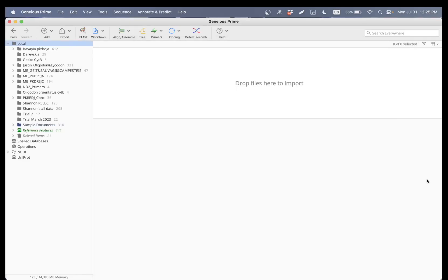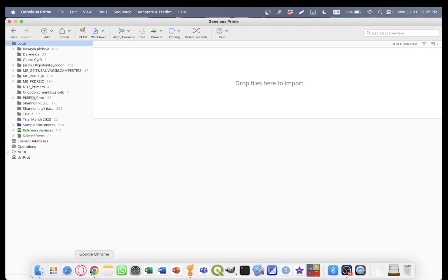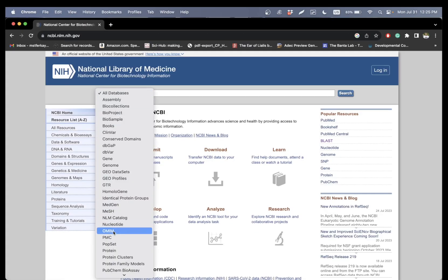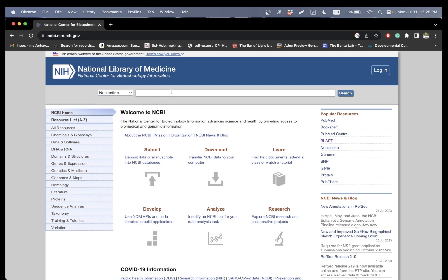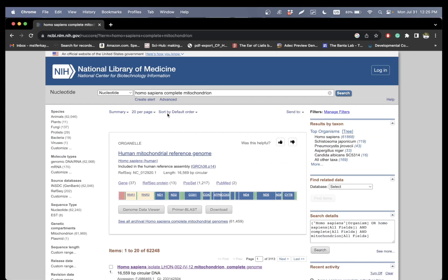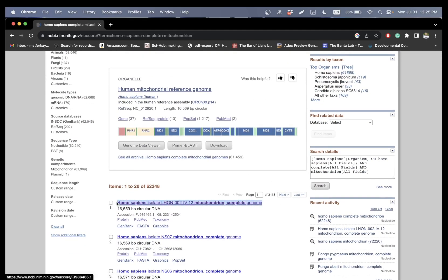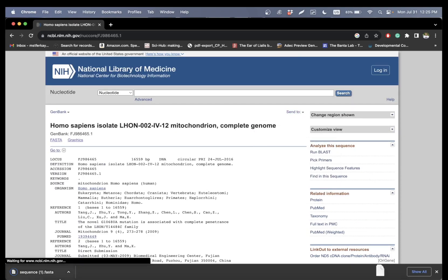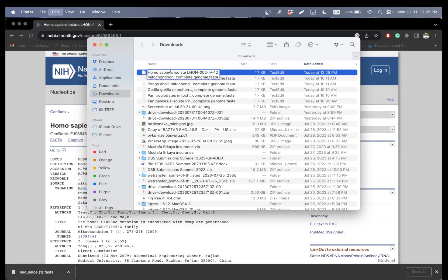Hi everyone. In this tutorial I will show you how to align sequences on Geneious Prime. Let's go ahead and go to Google NCBI. I will use mitochondrion genome for primates complete. I already downloaded the other primates, so let's get this one, copy the name, create the FASTA file, and rename it.